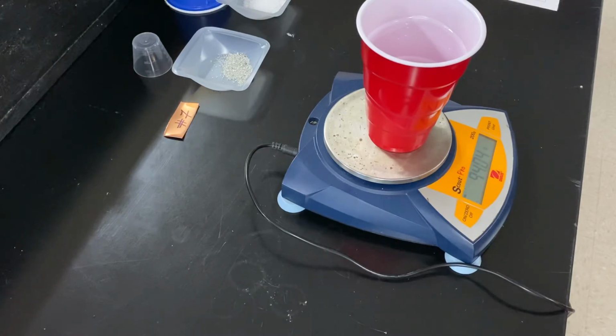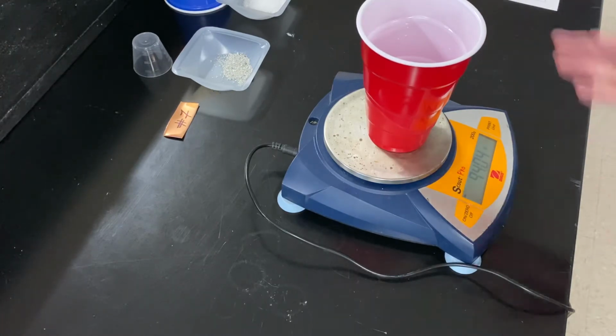94.04. So what we want is, again, we want 3 sig figs. So we're going to say that this is 94.0 grams. 94.0.